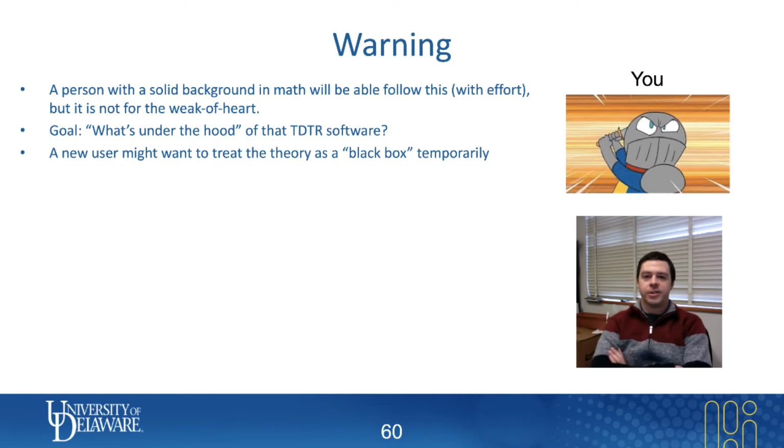Hello there. I just want to issue a little bit of a warning about this section. So, what I'm going to do is go through a rather, I would say, challenging academic paper that describes how the time domain thermoreflectance software typically works. And it'll be somewhat challenging.